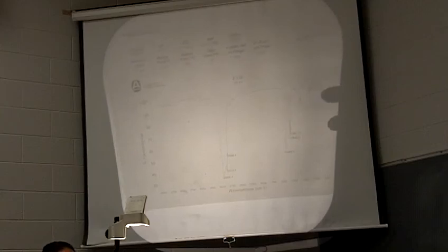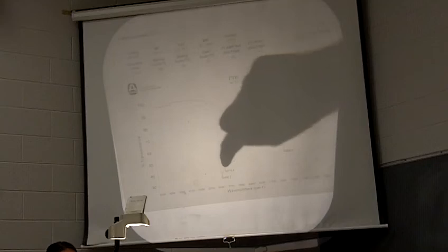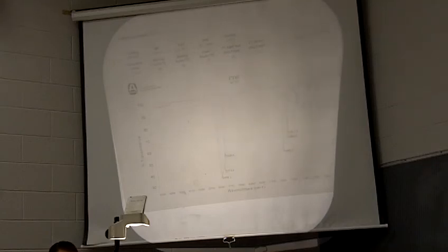All right, so now I'm going to show you two different alkanes. They're both 6 carbon, and I'm going to show you how the fingerprint region comes into play. Okay, so here's 2-methylpentane. That's a 6 carbon compound. It's an alkane, so there's just C and H, so we just have sp3CH stretching, CH bending, and then we have the fingerprint region.